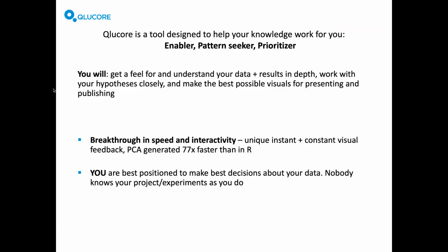You will get very good feel and understanding for your data using 3D interactive plots, flexible ways to work with lists, and you will be able to zoom in and out really fast on subsets, on results, to overview of the complete data set. And of course, the most fun part maybe is beautiful, stunning visuals for presentations, record keeping for publications.